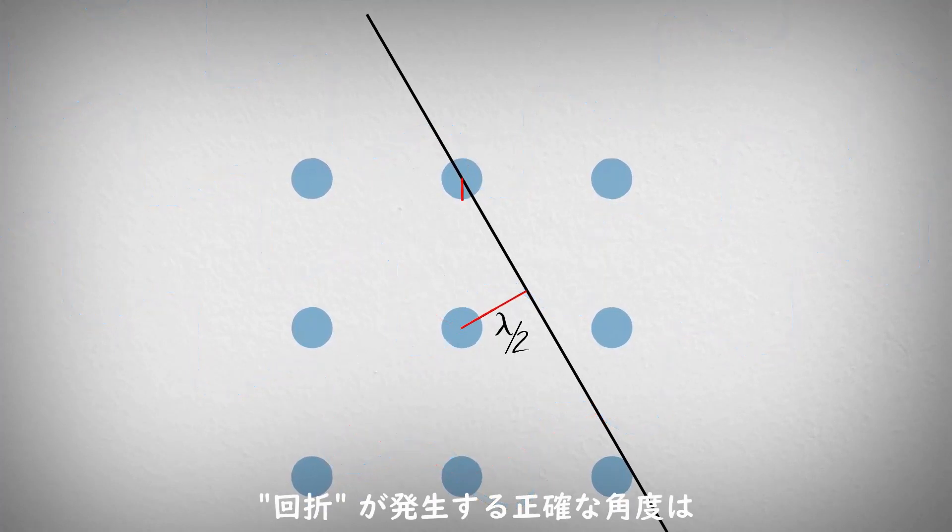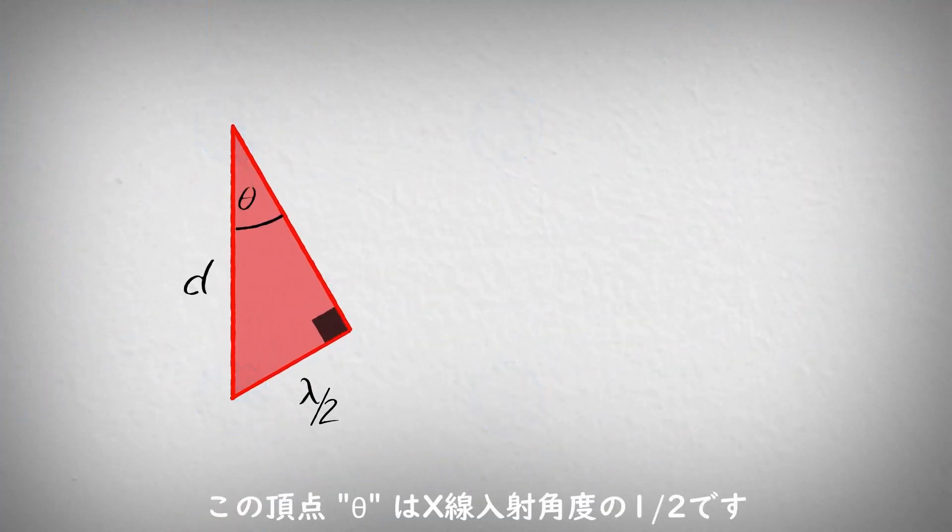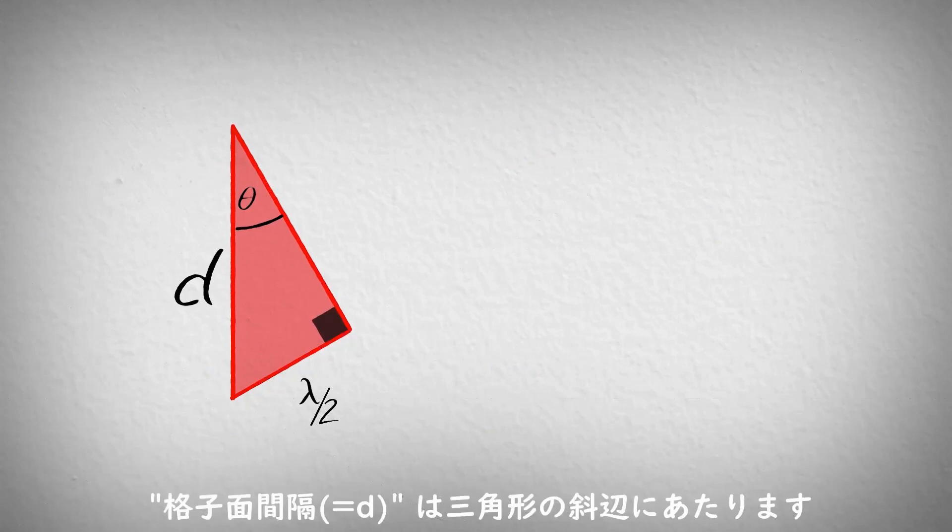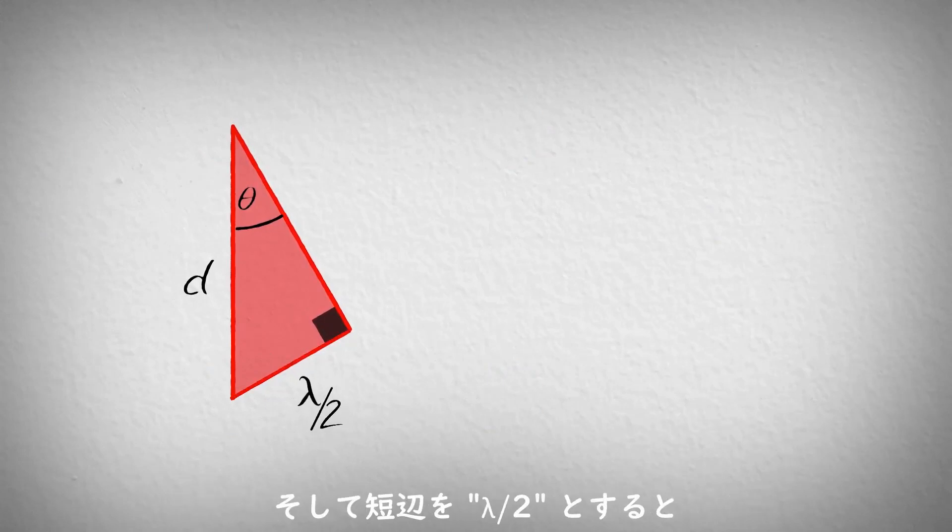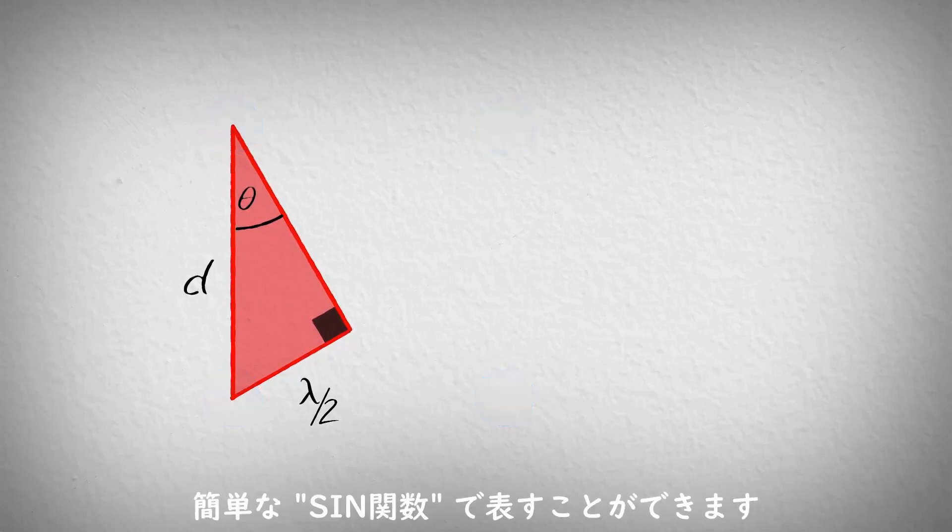The exact angle at which diffraction occurs can be determined from the red triangle. The angle at the top is theta, half the angle between the incident and scattered beams. The long side is the distance between the atomic planes, and the short side we know is one half of a wavelength. The relationship between the diffraction angle and the spacing between the atoms can be determined by applying the sine function.